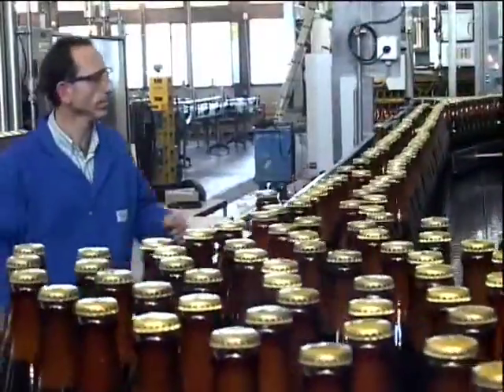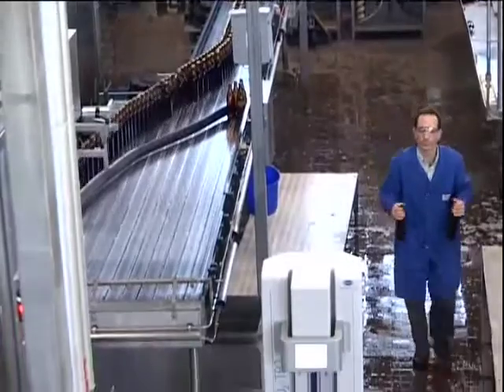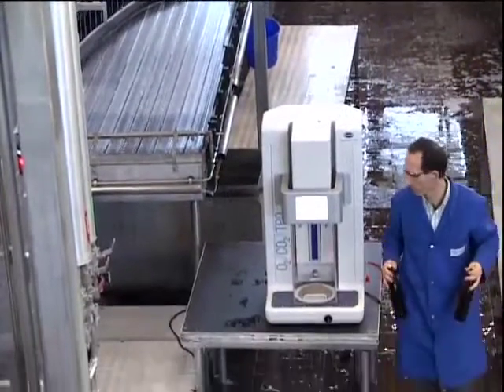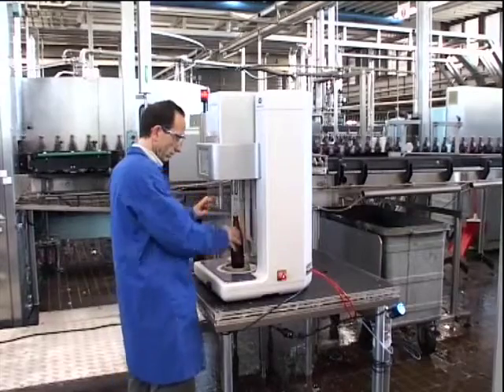The Orbisphere 6110 is designed for at-line operation, which means you lose no time taking samples to the laboratory for measurement. This improves productivity and analysis time.